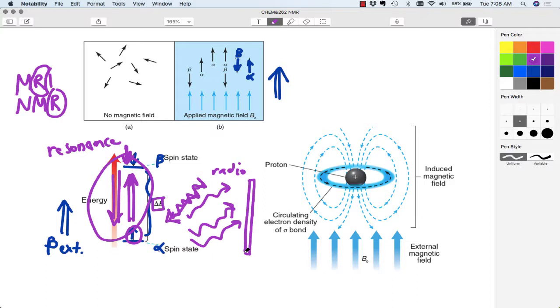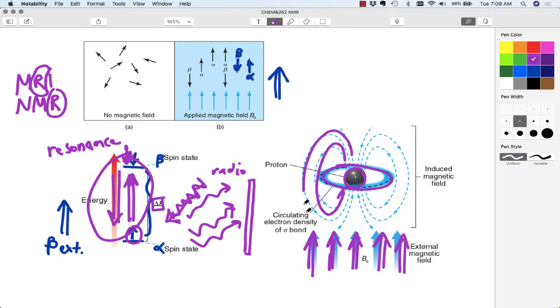So let's talk about the source of the delta E's. You know that the nuclei are charged particles, and so they interact with an external magnetic field. Let's say that you put a magnet up to a molecule, and what happens is that the electrons start moving. So you've got these electrons around the nucleus, and that induces or causes another magnetic field. That's called the induced magnetic field. So this is coming from the atom in response to the external field.